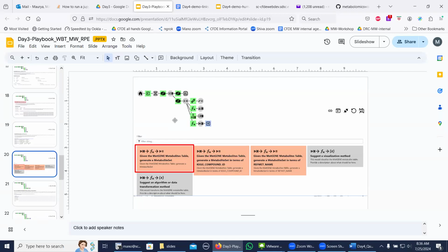Based on that, they already have some ability through an AI-based assistant, where you can type or speak the question that you are trying to address, or just speak a little bit about your research study, that this is what you want to accomplish. Based on the learning it has done so far, it will try to come up with a tentative workflow, which you can further modify.